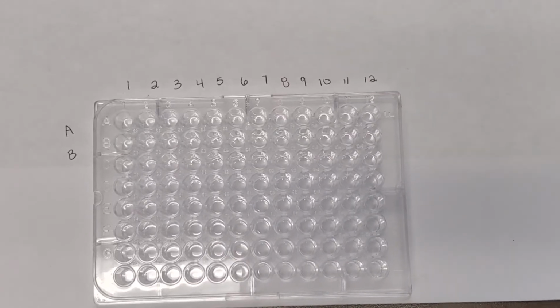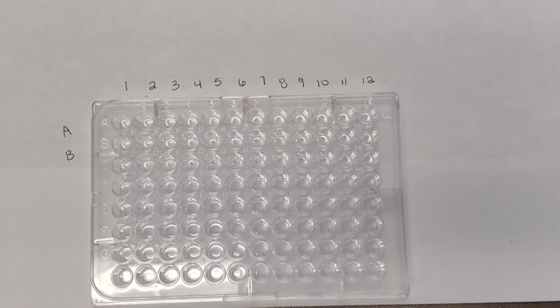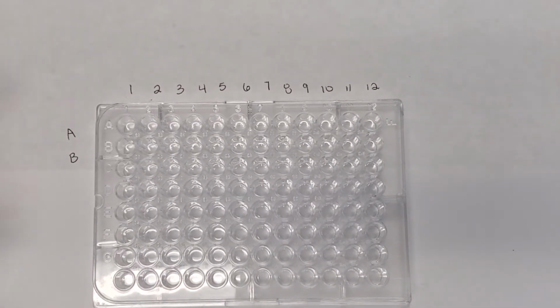Okay, so what we're going to do today is the ELISA. And remember, the ELISA is looking for antibodies. So every time that we do an ELISA test, we perform a triplicate. What does that mean? It means that we are performing a test on each patient 3 times just to make sure that we're not getting any false negatives or any false positives.